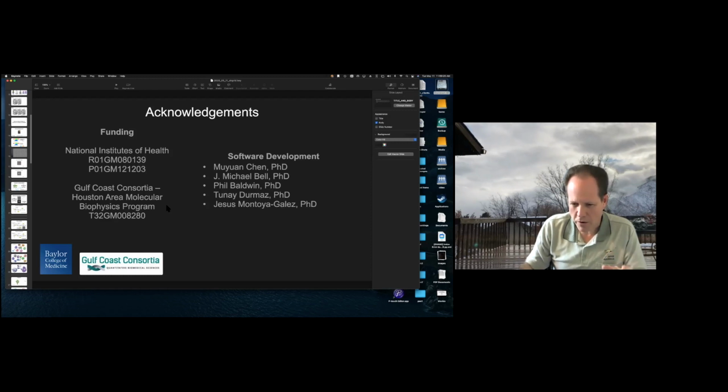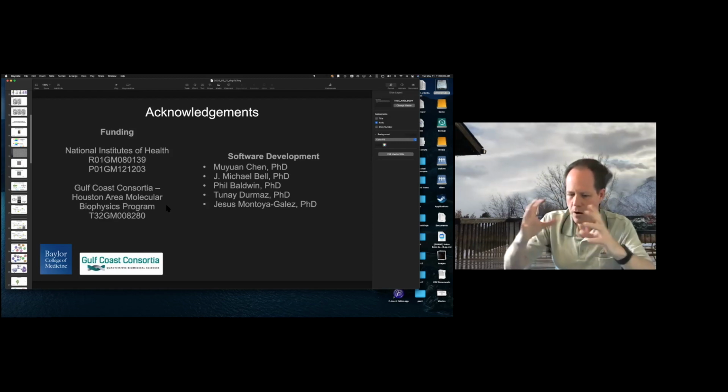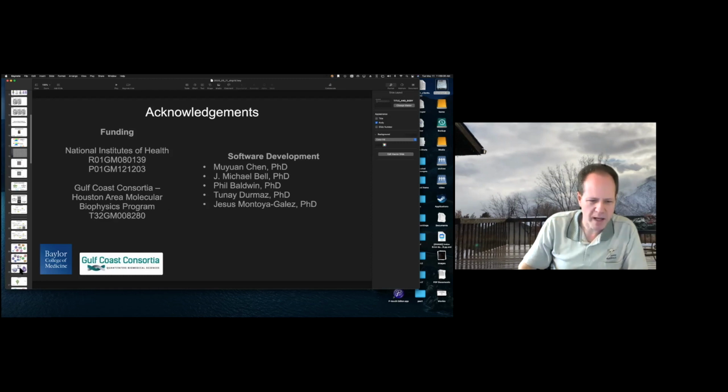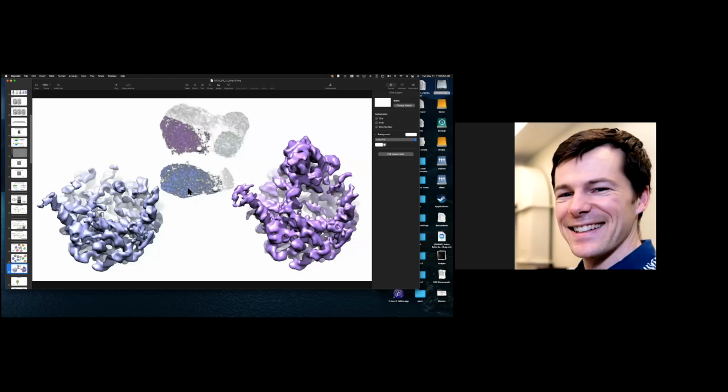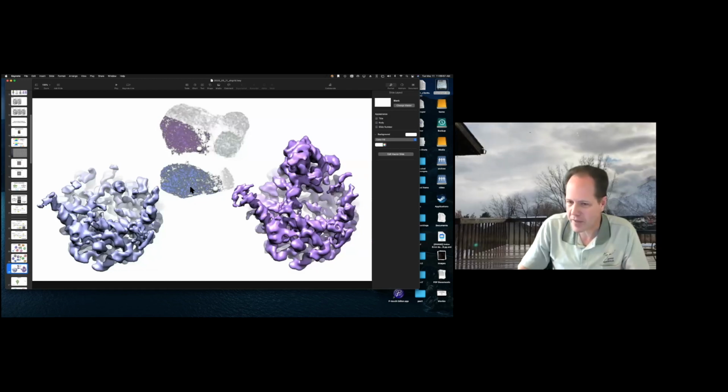But most of the motions that you see in macromolecules are much larger scale. As long as you can characterize the motion, which doesn't take very many Gaussians, when you do the reconstructions, you're using the original particles, right? So the limit in the resolution that you get is basically how big an area, if you're looking at one of these embedded spaces here, am I reconstructing using this, or am I reconstructing using this? If I use the points just from here, and I have enough of them, I can still get to a very high resolution in the structure. It's going back to the original data, to have enough particles for that very local neighborhood to get to that resolution, right?